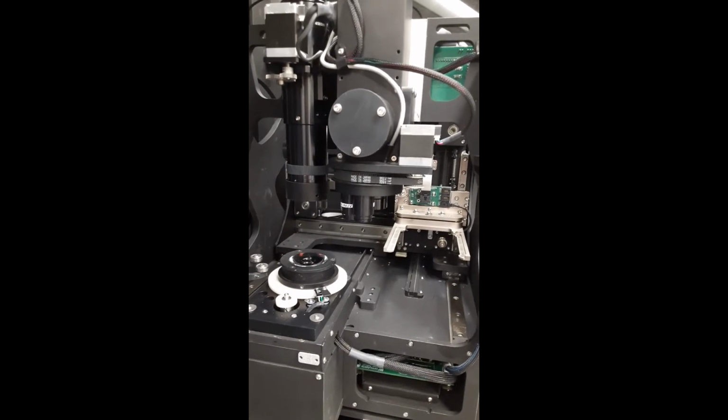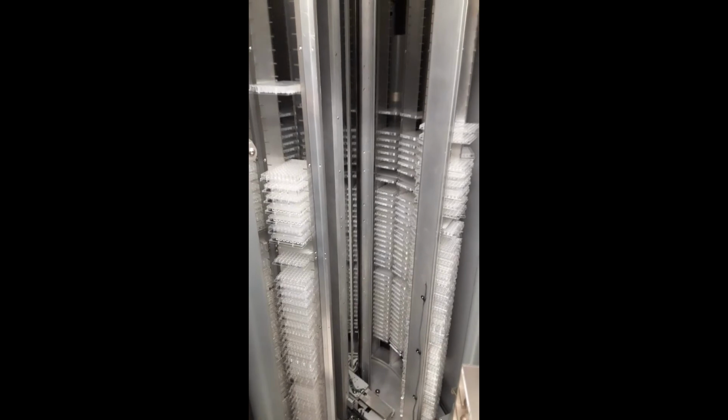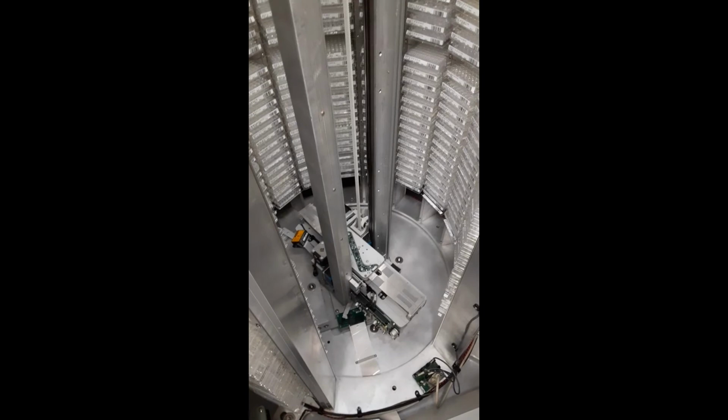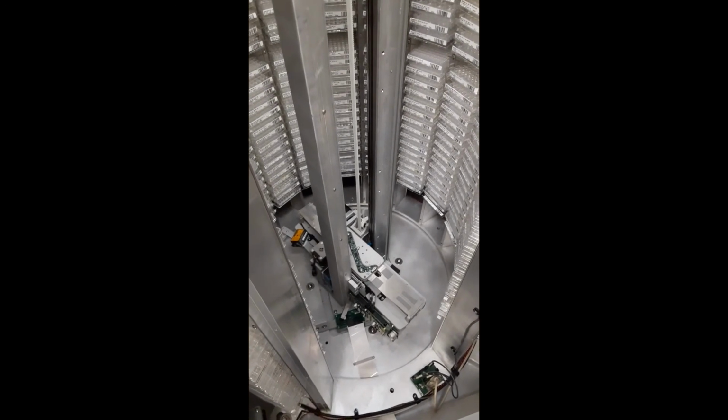We also have the visible and the UV microscopes. If we look in here, you can see all the plate hotels. It holds up to 1,000 plates that are the 96-well plate format. And down at the bottom, we see the two hands, which are responsible for moving the plates around the system. Also in the back, with the yellow sticker, we can see the barcode reader.